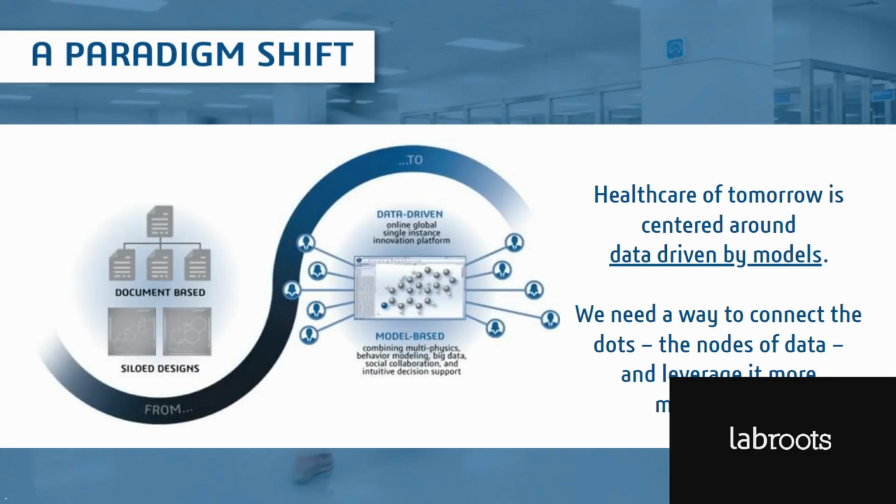So I hope that makes it clear why companies are starting to move away from siloed solutions towards more integrated and platform-based approaches. It's not only for the efficiency and compliance that we discussed, but because when you take a more holistic view of the information generated and transferred across an organization, then you can realize how important it is to have a consistent data model underpinning all of it.